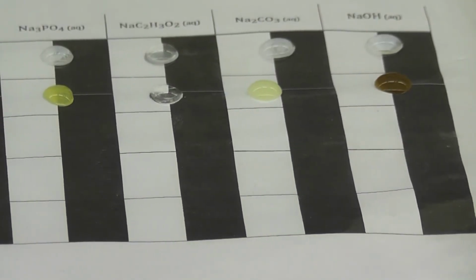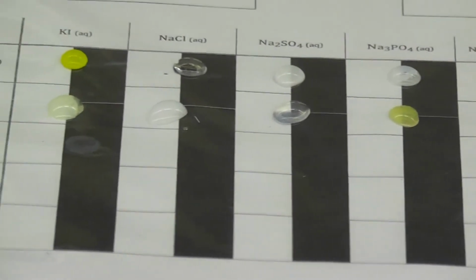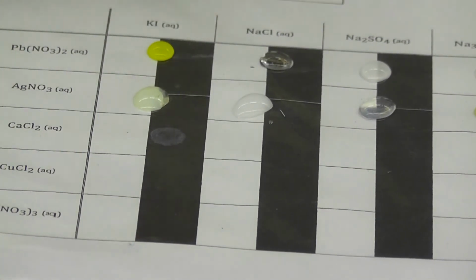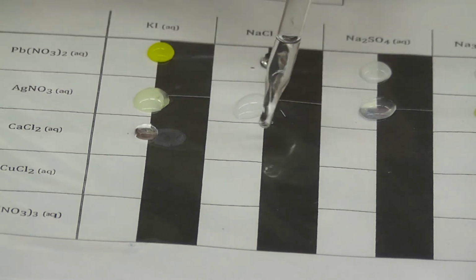Okay, for this next line, we're going to be using calcium chloride. And in order to save time, I'm just going to put 1 drop of calcium chloride in each one, and then we'll add the other ones up top. So 1 drop of calcium chloride on each one. So 1.